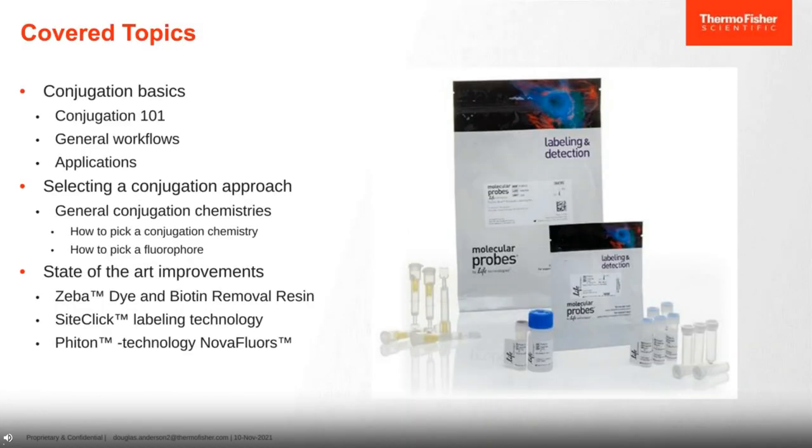Before we get started, I wanted to overview what we're going to cover in today's webinar. We're going to start with some basics just to make sure everybody's on the same page: some general information about conjugation basics, how the workflows come out, and types of applications you might be using conjugation for. Then we'll move on to some more nitty-gritty with one of the questions I get all the time as a conjugation chemist, which is, how do you select a conjugation approach and how do you pick a fluorophore? What is the right conjugation for you, whether you're going to create your own conjugate in the lab, using a kit or freehand, or if you're going to purchase a conjugate for your experiment.